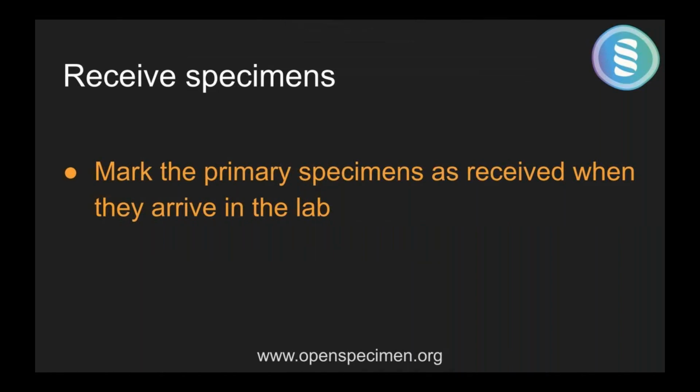This works only for the primary specimens, because obviously primary specimens are the only ones which have the receive event attached to them. So that's pretty much what I just displayed.